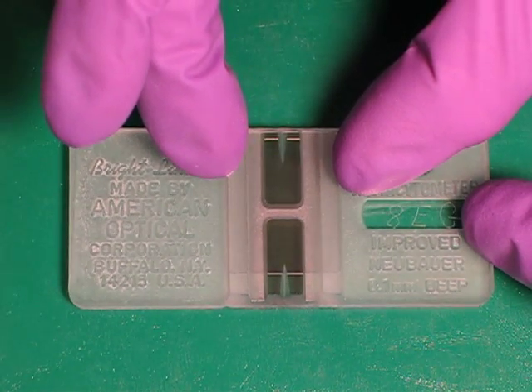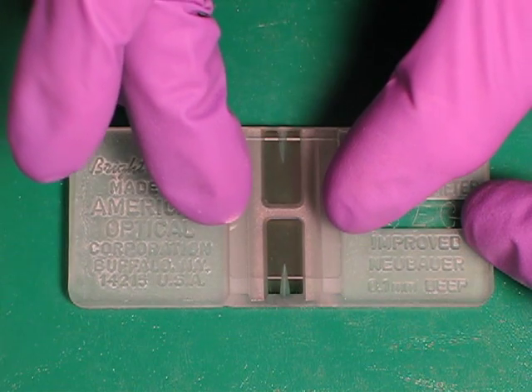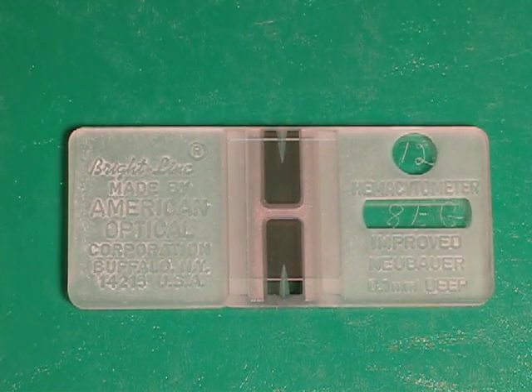I'm going to place the cover slip right down onto the hemocytometer and place it so it's sitting in the middle.